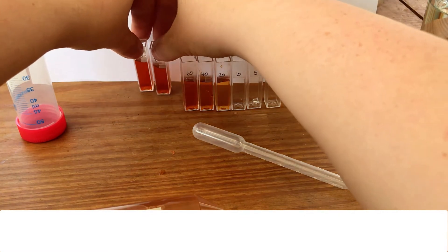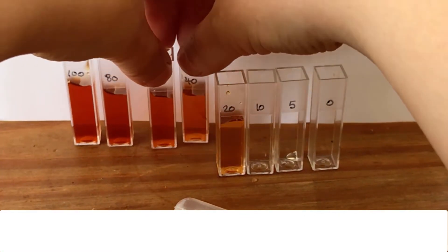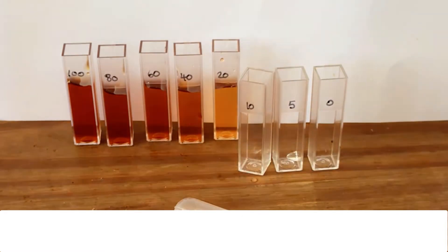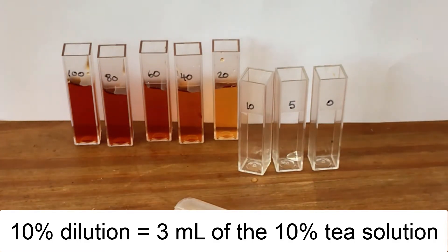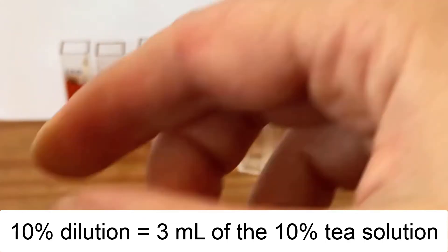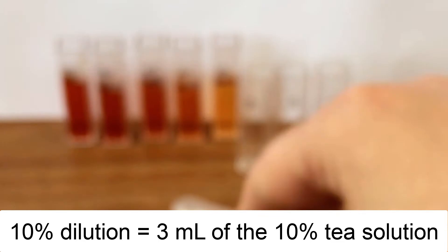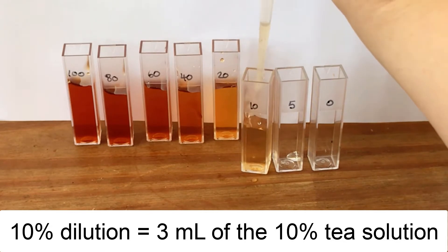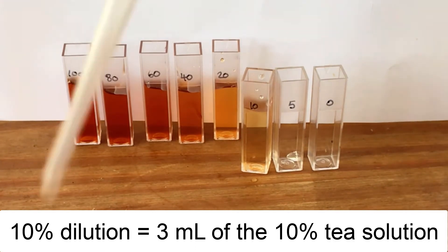So there we go, I've got my first dilutions in there. You can see that the color is getting fainter. I'll just put those against the white card so you can see that a little bit better, so you can see the concentrations or the color is getting weaker each time.